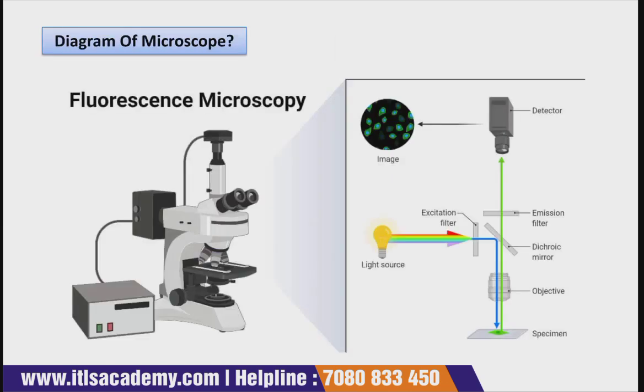Now let's see the diagram of the microscope. This is a type of fluorescence microscope. Somewhat it looks like this, and it has a detector, through which it detects a sample.